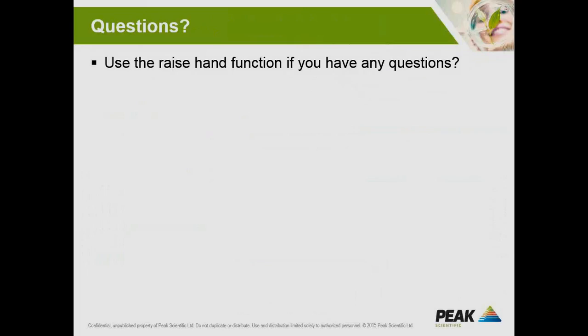Hello. Hey, Dr. Red, thank you very much. It was quite informative. I just have a couple of questions here, which were mailed to me from one of our customers. It says, what's the consumable need for the generator? So he's actually talking of a stack. He wants the hydrogen, air, and nitrogen gas. So he's asked for the consumables that would be required for the generator for 3 years.